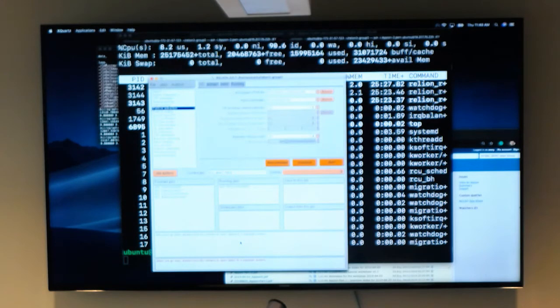You may have only done one class. Many people don't know it, but if you go into 3D classification, and you go into your optimization tab, you can choose one class. That's fine, you might only need one class, that's okay.